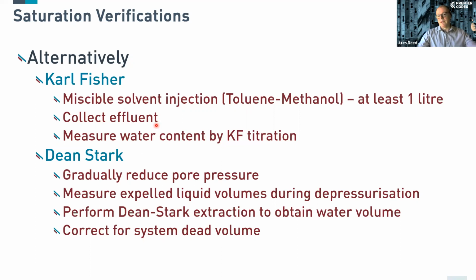So we can determine final gas saturation. We can also determine the final water saturation. Or we could do Dean Stark. Now, Dean Stark requires, if it's in a core holder, we take it out of that core holder system. That means depressurizing that pore system. And so as we depressurize, we may get gas expansion, and fluid may be pushed out of the core.